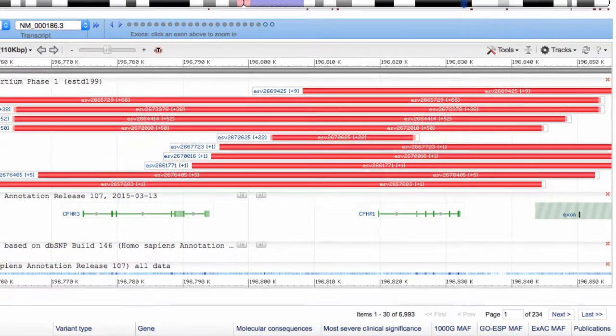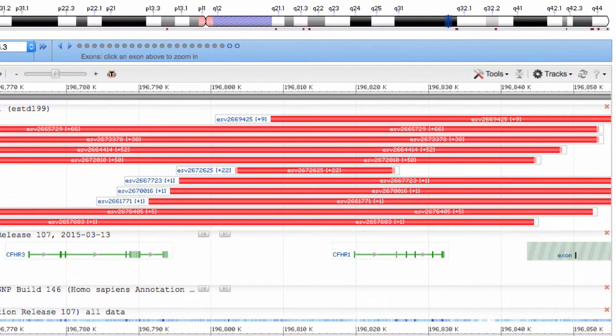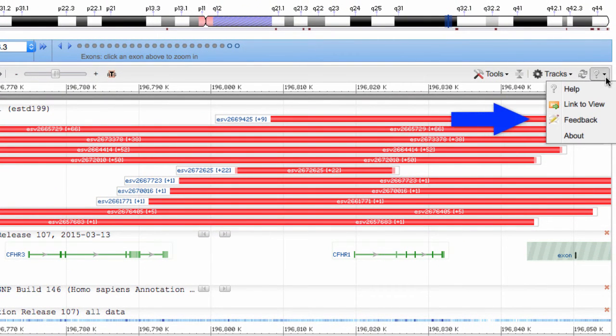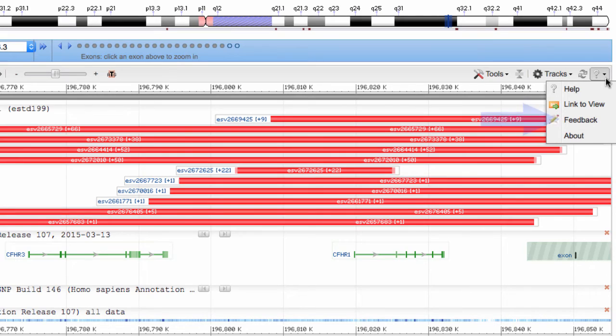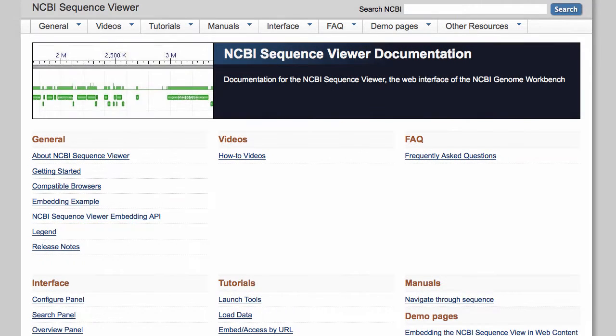We encourage your feedback, so use the Help menu next to Tracks to let us know how we can make Sequence Viewer better. And follow the Help link to read about other improvements, get help documents, and link to other videos.